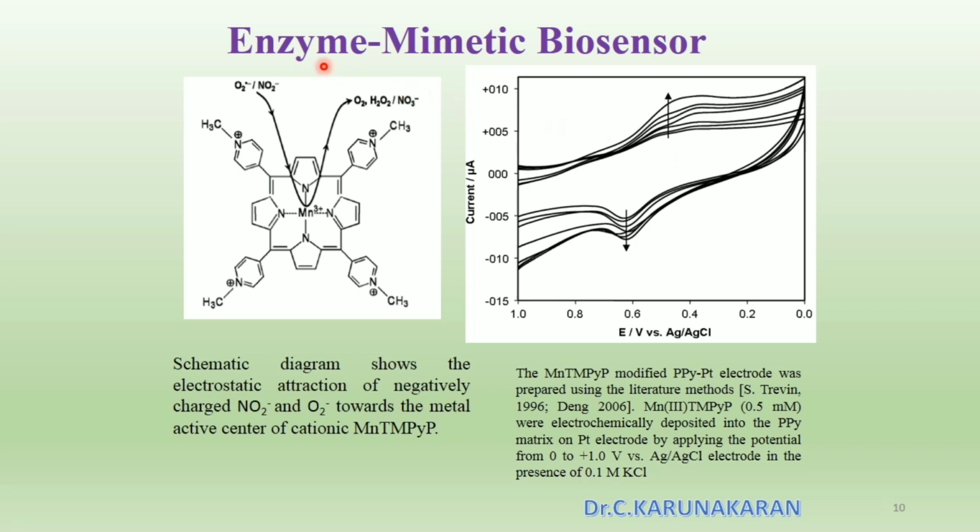Similar to SOD1, here we have used the metalloporphyrins and measured the levels of nitrite and superoxide radicals.